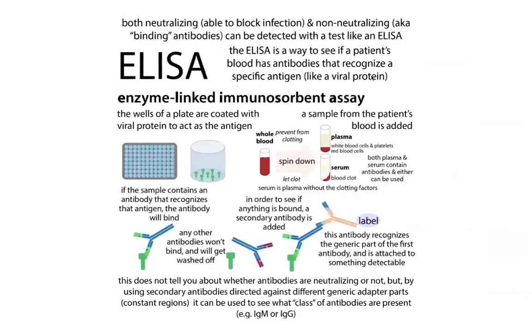There are also other methods where we have the antibody bound to the chip, and then we flow something with antigen over it. So remember, antigen is going to be the thing that the antibody binds to. And this way we can detect that bound thing, that binding partner binding to the antibody.